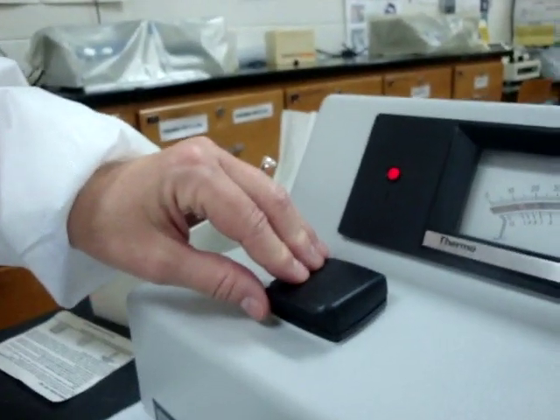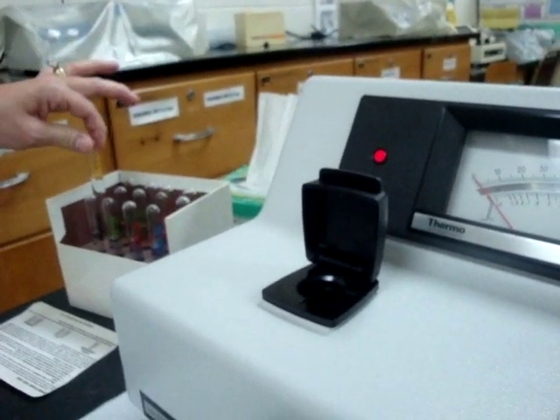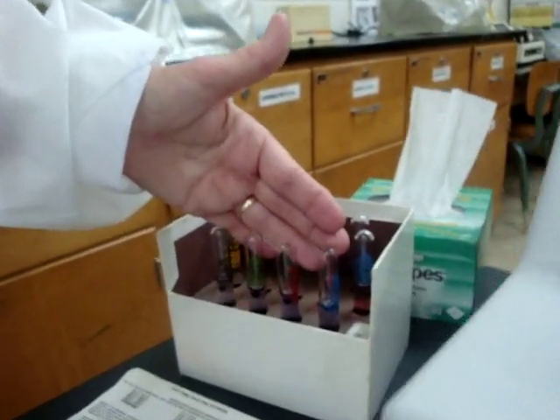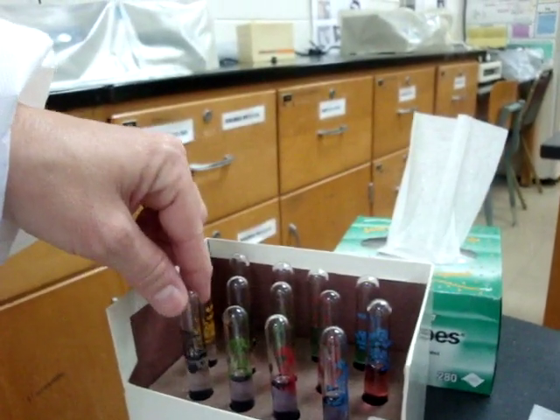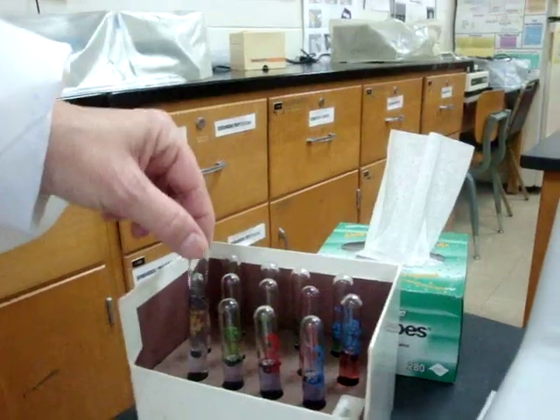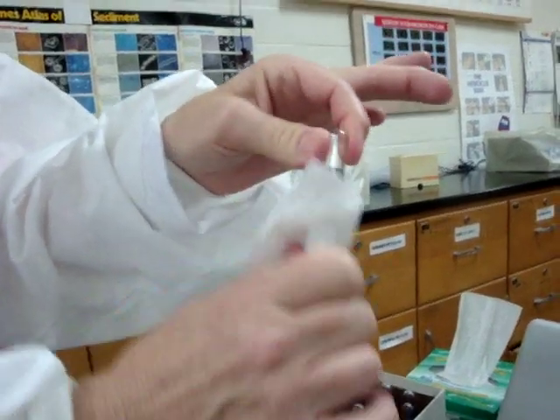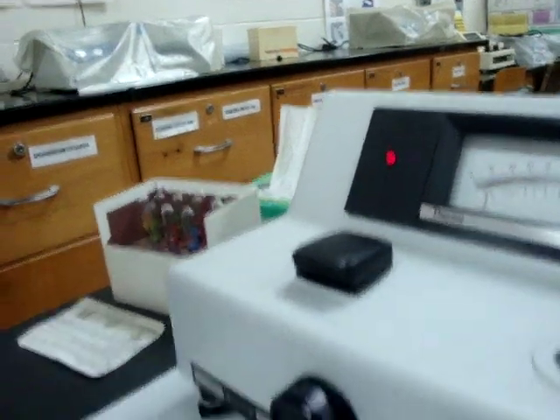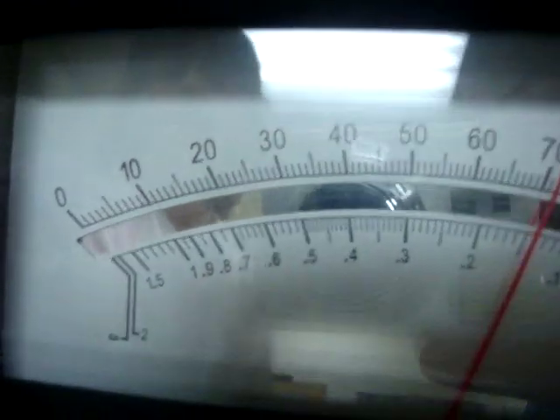Once zero and 100 percent transmission are set with the blank, remove the blank and begin the function test. We'll check the spectrophotometer using 420nm concentration standards: 0.25, 0.50, 0.75, and 1.0. Take the 0.25 concentration, wipe off fingerprints, place it in the compartment, and take the reading. The absorbance is on the bottom — the reading is 0.14.